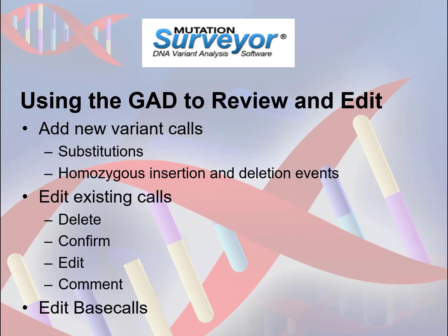The Graphical Analysis Display, or GAD, can be used not only to review your project but also to edit variant calls for a given sample. New variant calls for substitutions and homozygous indels may be added, and existing variant calls may be edited, confirmed, or deleted. Comments added to specific variant calls provide additional customization to the project. Base call editing in the trace files can help correct sequencing errors. Reprocessing the edited files can sometimes assist in producing a larger comparison region to extend automatic variant detection.